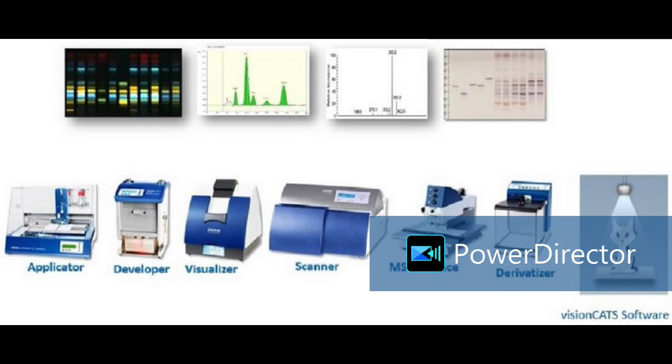You know, qualitative means RF values, matching absorption spectra, matching color. After that, quantification also with standards. You can see standard matching with samples. Means the standard's spectra will come into your library now. So if there is any unknown sample, you can compare it with the library spectra, and you will see the matching, whether it is matching with tetryl or TNT or RDX. Based on that, you can decide what exactly is in the unknown compound.